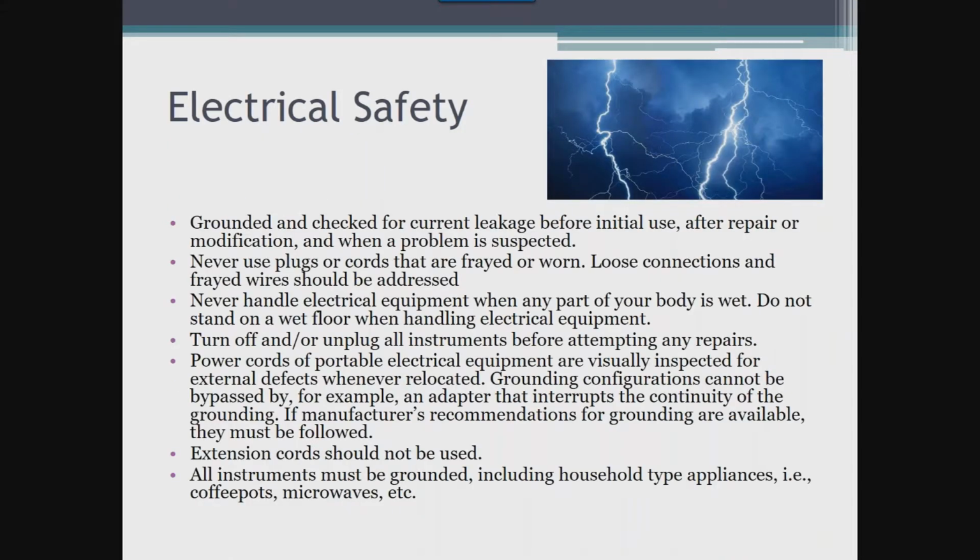Electrical equipment is prevalent in the laboratory and can be a cause of fire and/or injury to our staff. No different than when you first bring a new appliance into your home, when we first bring equipment into our labs, we must ensure that it works properly and is safe to use. Then, on an ongoing basis, we make sure that it is functioning correctly and safely.